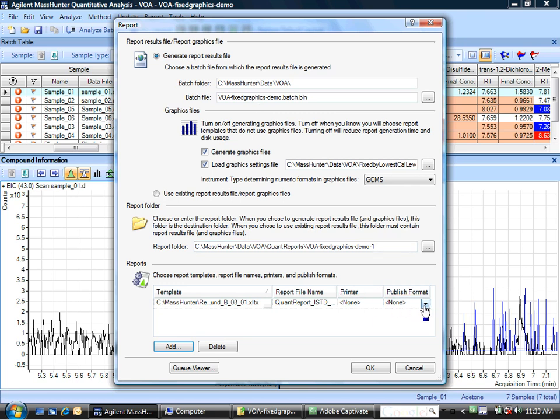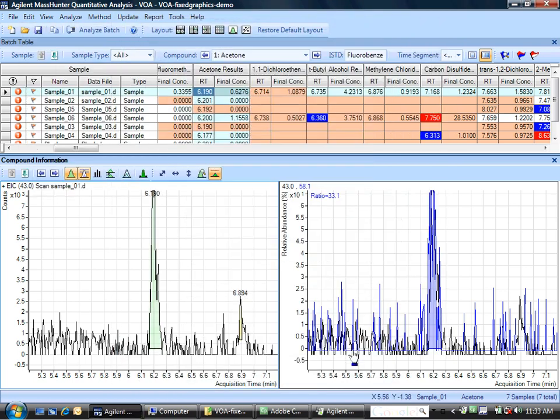So I've taken that, and I will also choose to create a PDF version. So let me fire that up. I'll start the Q viewer, and in a couple of moments, I will see that rolling, and then I will show you the report, which has, as I mentioned, the graphics in that compacted version sorted by compound, and that allows me to visually inspect using the report.